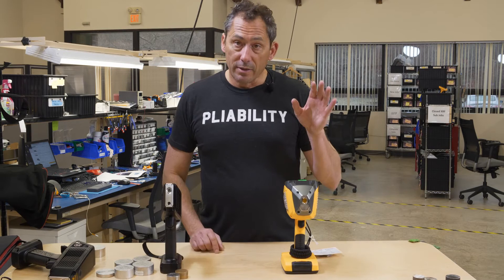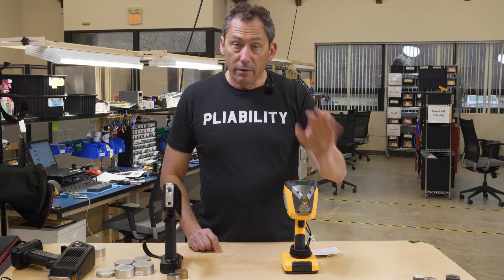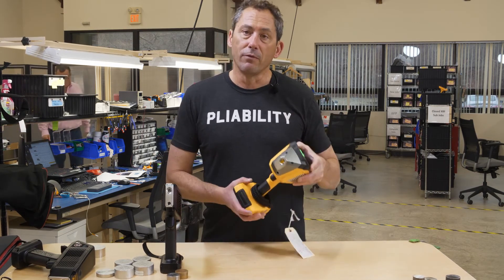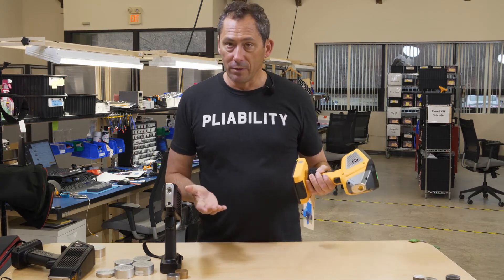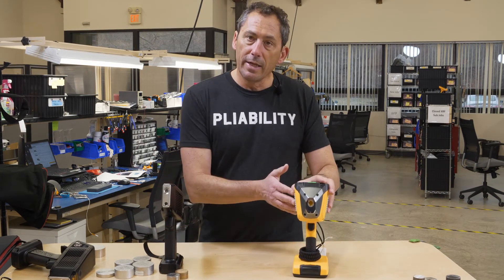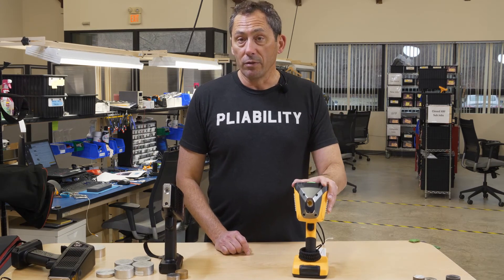you just want to get out there and do alloys or do NDT — verify your alloys or sort your scrap — and you want a great price on a unit, this is a great option for you. You may have to get five or ten units for some facility. And if you just need a good performing unit without the elegance of design, a little more weight on this one, then you can save a lot of money with this unit now.